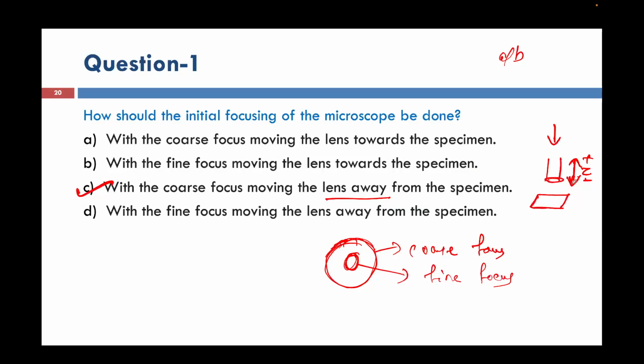Yes. When we talk about the vertical microscope, when the stage moves, there is a chance of hitting. But with the inverted microscope, there is no chance of hitting. So this question, I think, may need to be modified. With the inverted microscope, there is no question of moving away, because if you take, for example, 50x, you will only be moving upward, because your stage is moved. There is a safety feature. It will not hit at all, and it will not go outside either. This is the inverted one. If you talk about inverted, then C is not applicable.